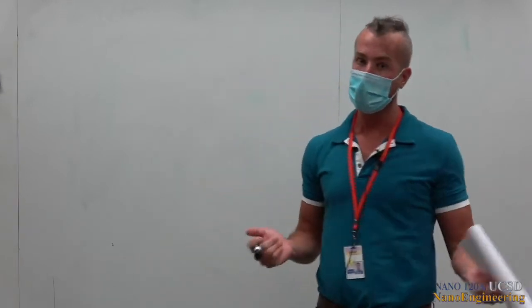Okay, well, welcome to today's lecture and brief lab demo on dynamic light scattering. So this instrumentation module is going to talk a little bit about how the system works, and then I'm going to briefly show you the instrument and the software. But then there's going to be a fairly extensive module where you use the instrument remotely while we change some samples out for you. Okay, so this is going to be, fortunately, one of those opportunities for you to actually use an instrument, which I'm really excited about.